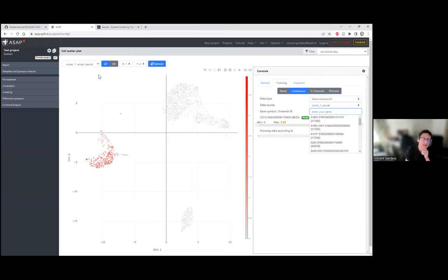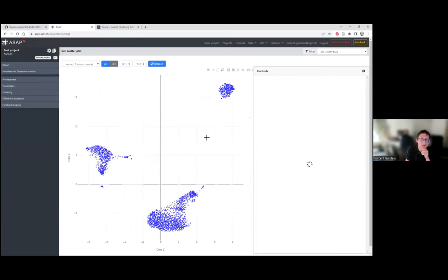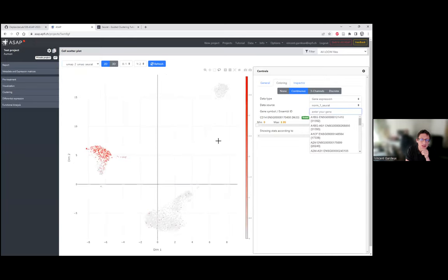You saw I've tried two, just to show you here in the visualization. Now I can use whether my 10. So the first one was 10. Here it's a UMAP plot with 10 PCs, and this is a UMAP plot with 50 PCs. You may see it's shifted a bit, which is normal because UMAP is randomly generated. But you see the populations are the same, so it doesn't really change the results much.